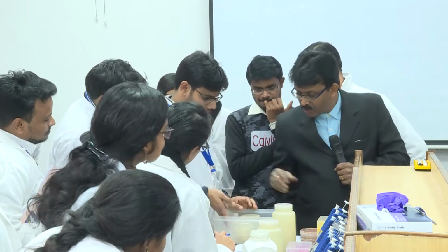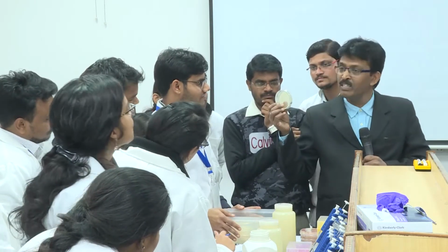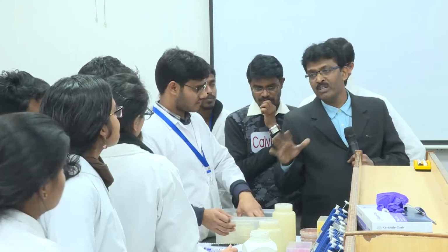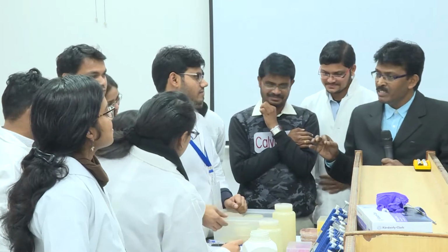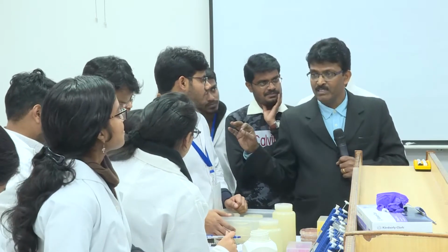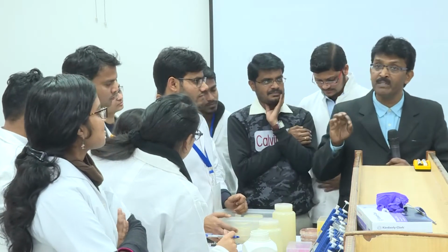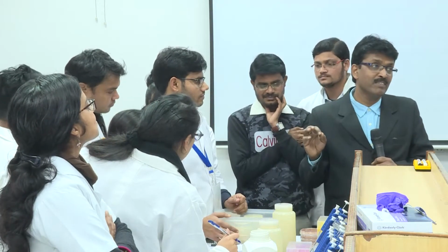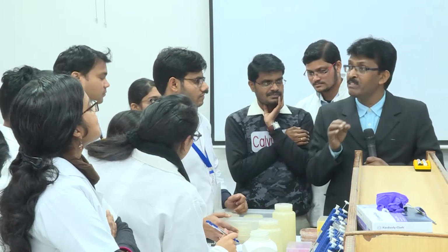Okay. Now, some plates I am seeing fungi, so that means it's a very poor handling, right? So always remember, this kind of work you have to give a lot of time. You cannot do it in a hurry. If you do it in a hurry, it is bound to fail. In microbiology, these two are two opposite poles. You have to give enough time, and you need to have a lot of patience and planning. 99% planning only, right? You prepare everything well in advance.